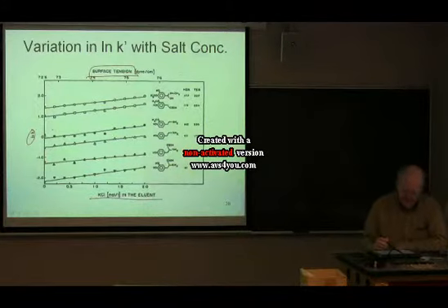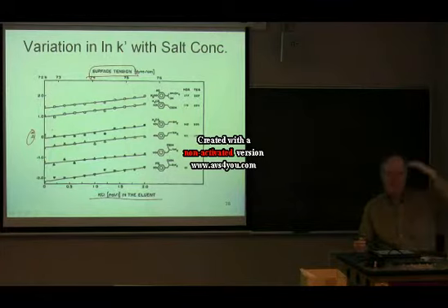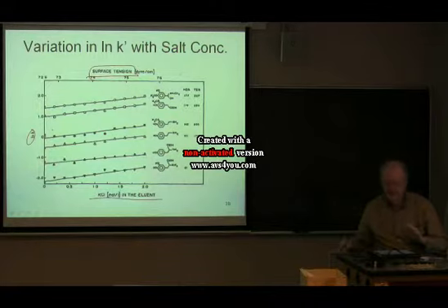Measured surface tension of these solutions of potassium chloride. And you see it's a nice straight line, just like Horvath said it would be. It's proportional to the surface tension of the water, of the aqueous phase. As you add these salts to water, you raise the surface tension of the water. As you add organic to water, you lower the surface tension, and therefore you lower retention. So it's a nice story.